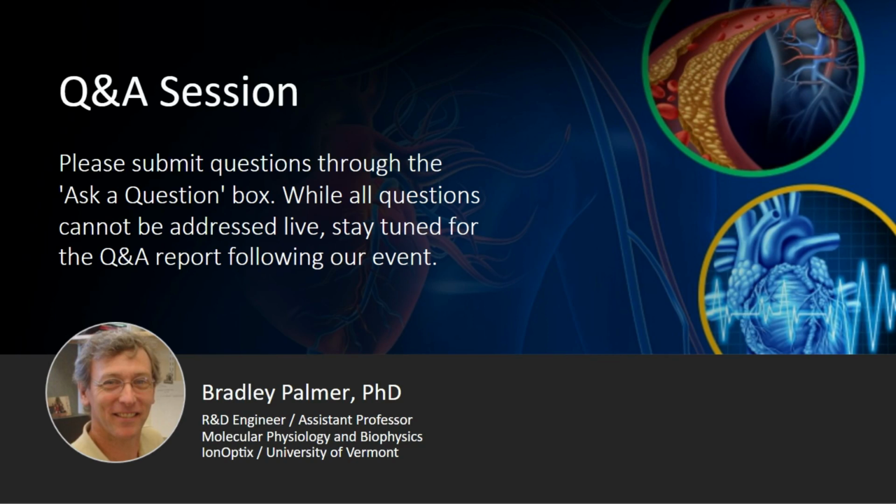There are three references in particular that I put an asterisk next to that are, I think, especially good for that purpose. And then the adhesive is a histoacryl made by Braun. The information for that is also found in those references. Perfect. So I recommend everyone pop over to the resources at any time during this talk, and you can download that file.